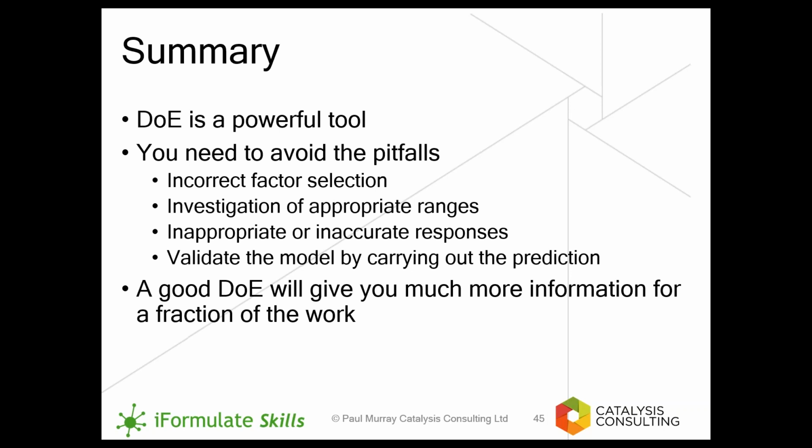Okay, that's fine. Thanks very much. Next question we have is how do you actually calculate the uniformity of the blend in that case study? What does the uniformity of 0.01 actually mean? So essentially we're using multivariate analysis. We have an infrared spectrum of the completely homogenized blended material. We have the infrared spectrum of the individual components, and you use multivariate analysis to look at the small peaks that are changing very subtly as you go from the individual components to the completely homogenized blended material.